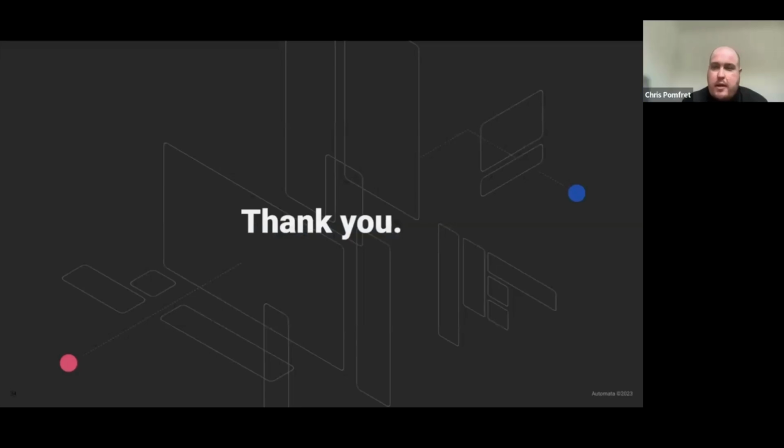Thanks, Russ. That was great. Yeah, we've got a few questions in the chat, so we'll just run through them now. The first question is, biology is somewhat variable and a fixed timetable might not work for my cells. Could I get an automated system to start a process based on real-time data, such as a cell number or confluency?